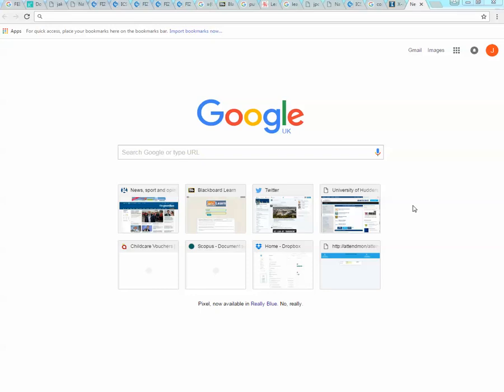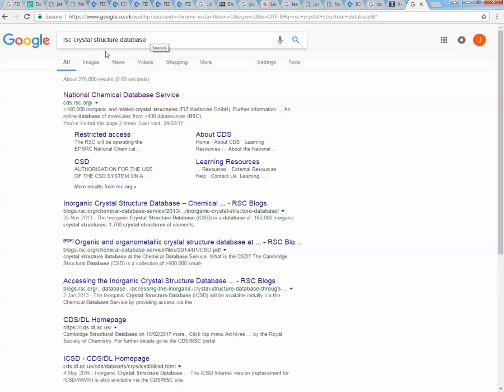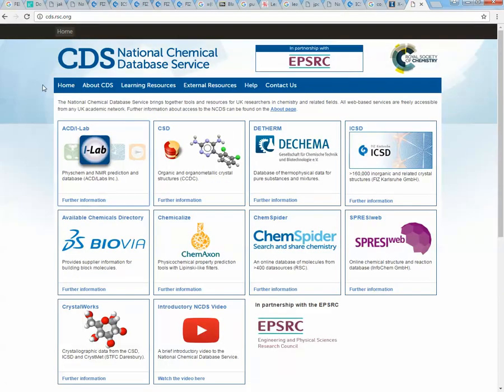This video is going to show you how you can get some information about the X-ray diffraction patterns of crystal structures, and it'll also give you other bits of information about those crystals, all those minerals. So first of all, if I Google RSC and crystal structure database, you get to something called the National Chemical Database Service, click that one and you end up with this box.